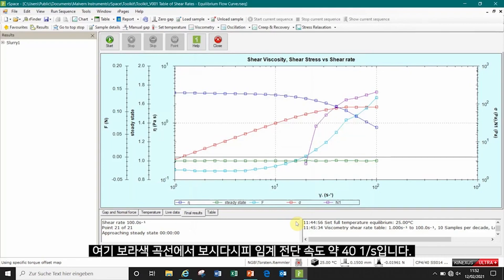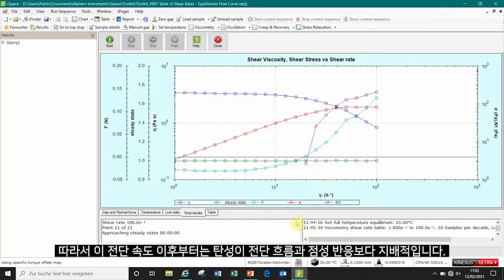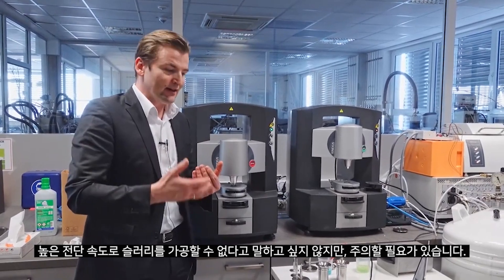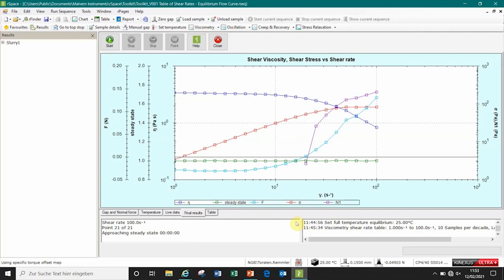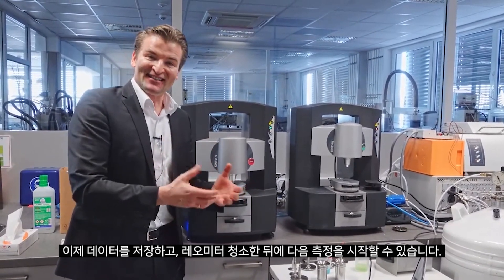From the purple curve you can see that at a critical shear rate of approximately 40 reciprocal seconds, the normal stresses become higher than the shear stresses. From that shear rate onwards, elasticity dominates the shear flow over the entirely viscous response, so it becomes more critical. I don't want to say you cannot process your slurry at high shear rates, but you need to be careful — always monitor both the viscosity and the elasticity in a flow curve measurement. So that's all. We can save the data, clean the rheometer, and start the next measurement.